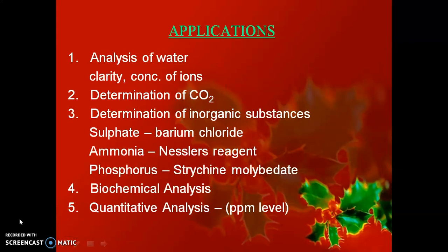Then applications. It is used for analysis of water to determine clarity or concentration of ions. For determination of carbon dioxide, we can use this technique. Determination of inorganic substances such as sulfate, ammonia and phosphorus is also possible by this technique.